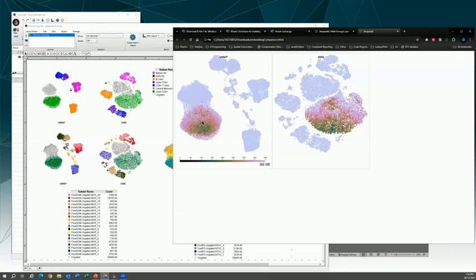When we get to the center, things start to blur and spread across. But when we get up on this other lobe, again, there's pretty tight grouping of events, at least in UMAP. But look over in t-SNE space, you can see things aren't as tightly packed and are spread around somewhat. And I found this other interesting area.